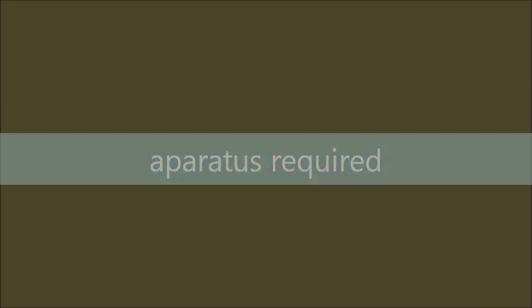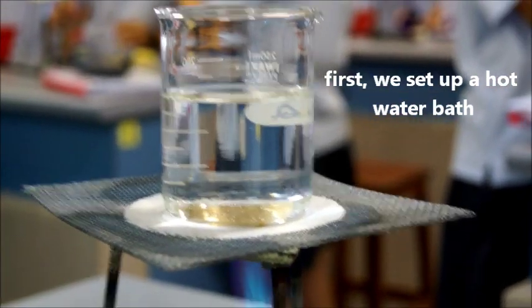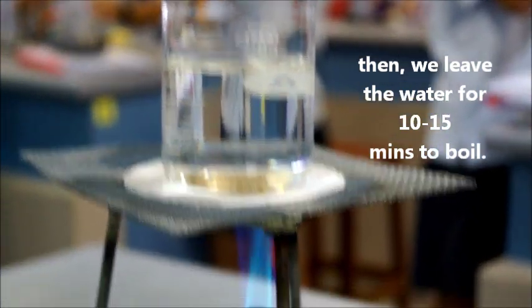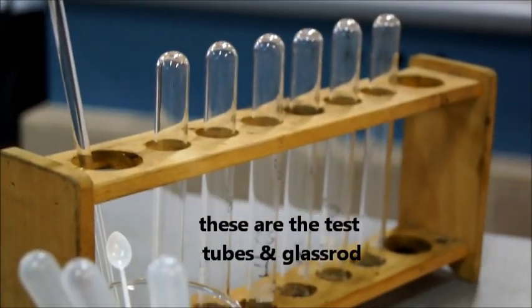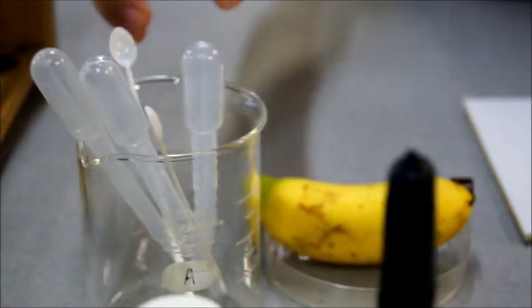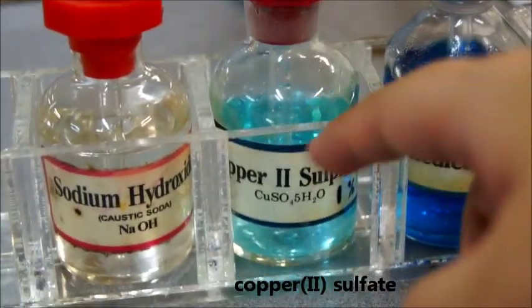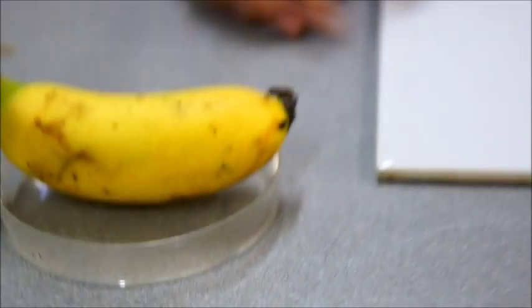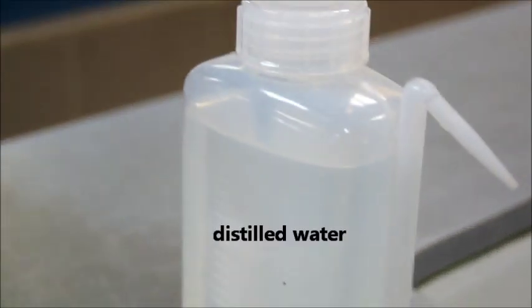Apparatus required. First, we set up a hot water bath. Then, we leave the water for 10-15 minutes to boil. These are the test tubes and glass rods. Benedict's Solution, Copper(II) Sulfate and Sodium Hydroxide, banana, white towel, pen knife, test tube holder, and distilled water.